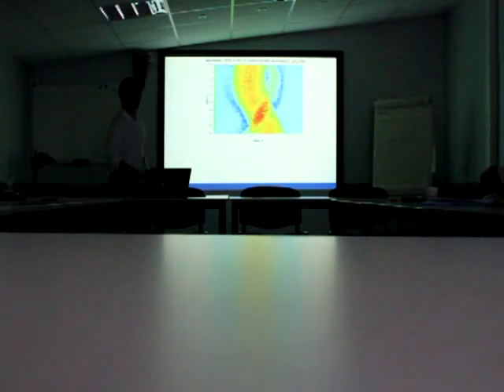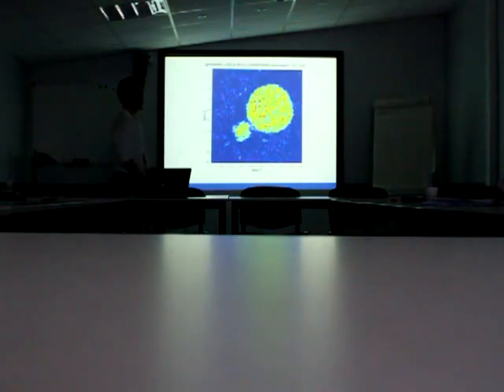So it means if you have a grainy sample, it doesn't work well. If you have a grainy sample or some sample with a preferred orientation, it's not going to be that good, because you're assuming that every projection has kind of the same scattering power throughout the sample. In my sample, I think it might be the wax or some piece of aluminum foil which I used in preparation that's stuck in there somewhere. But anyway, after removing these biggest spots, it's much better for the reconstruction.